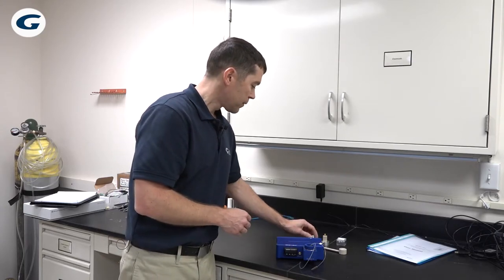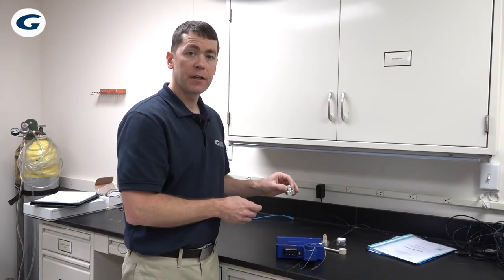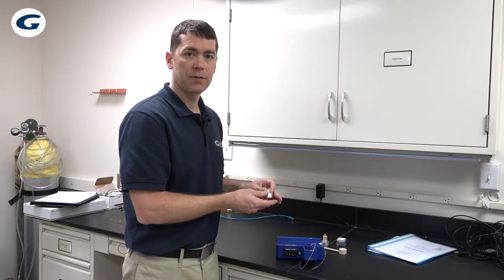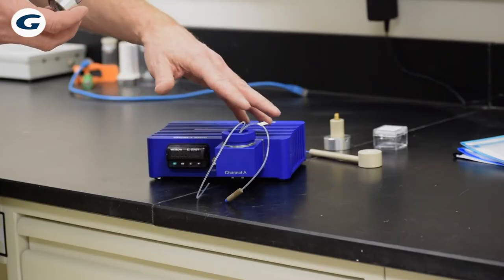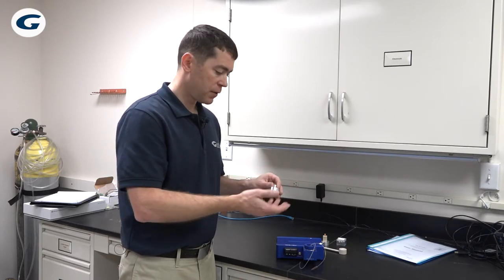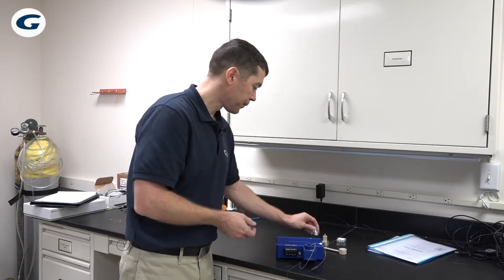There's a couple other accessories that could be useful for the QCM-I Mini. There's a simple training crystal here that you can use to monitor the fundamental and the third and the fifth overtones. So if you don't want to run any sort of wet chemical experiment, there's a dummy crystal in here that you can use to monitor frequency and dissipation and learn the software and so forth.